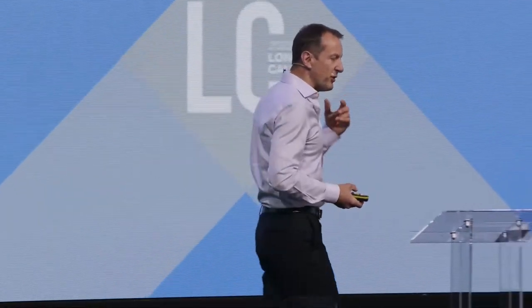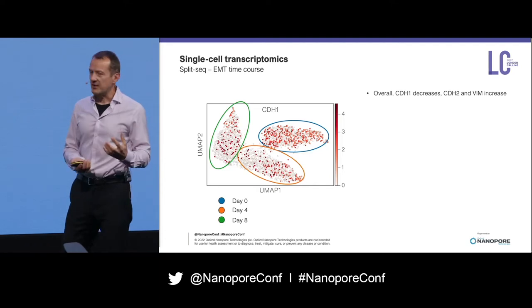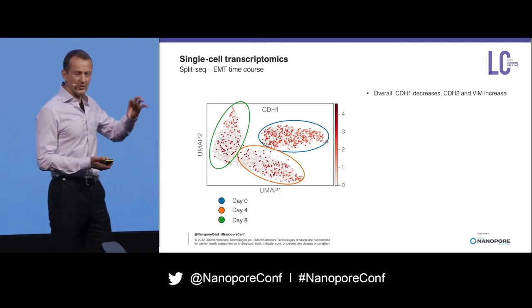So now we have this representation, we can then start to layer individual genes onto that and use a heat map to show the level of expression. Now, I really hope that makes sense. I have a layman's understanding of it, so that's the best I can communicate, but I think it will become clearer when we start to put the individual genes on here. So if we start with CDH1, the clusters still represent the same things. So we still have blue representing the cells at day zero, orange representing the cells at day four, and green representing the cells at day eight. And what you can hopefully see is the expression level of CDH1 goes down after day zero.